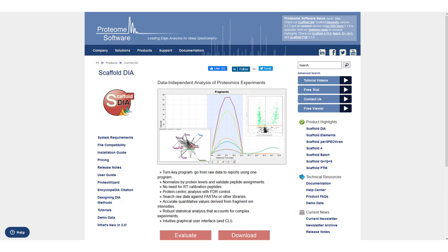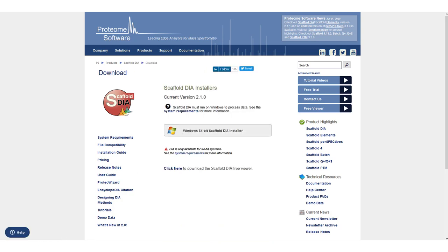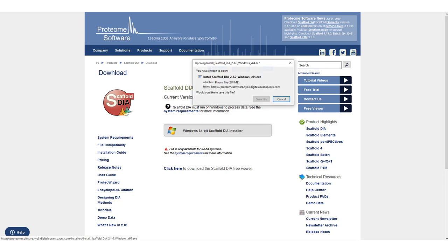Click to begin downloading DIA. When the file download is complete, double click to begin the installer.